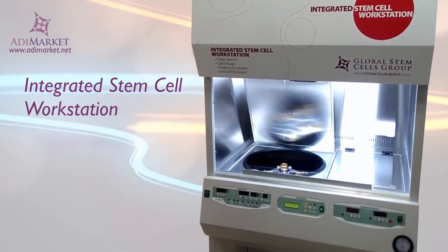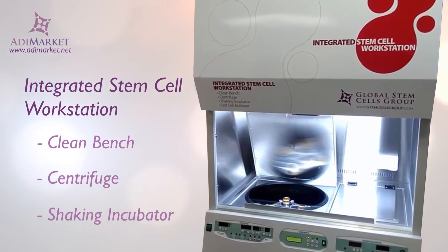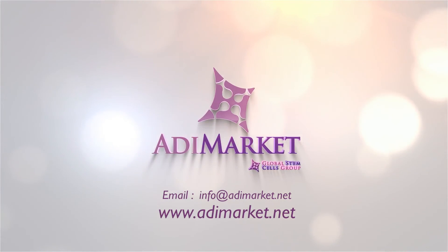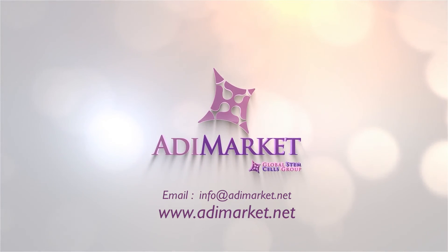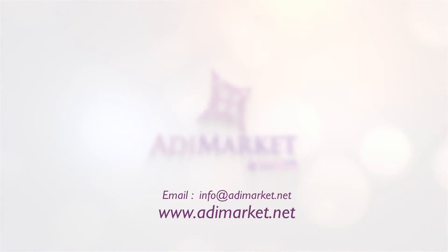Whether you're working with cells or blood, you'll have a clean, ideal environment for working when you order the live cell station for your laboratory. Order today by emailing us at info@addymarket.net or order right now online at www.addymarket.net.